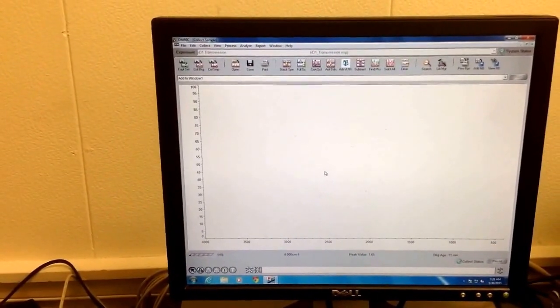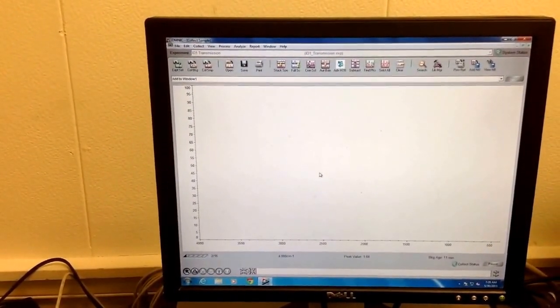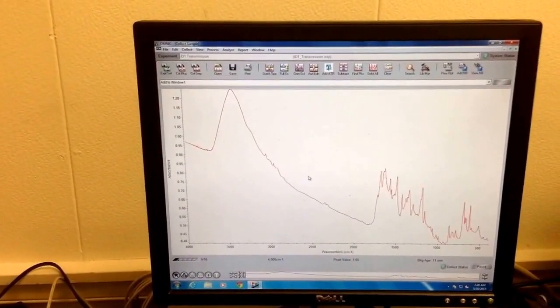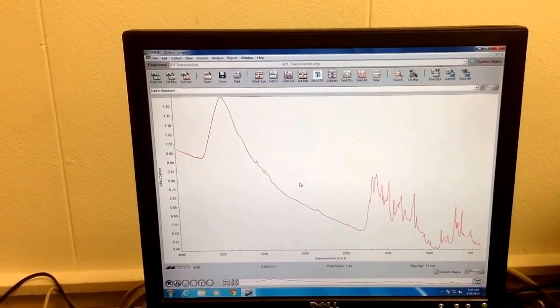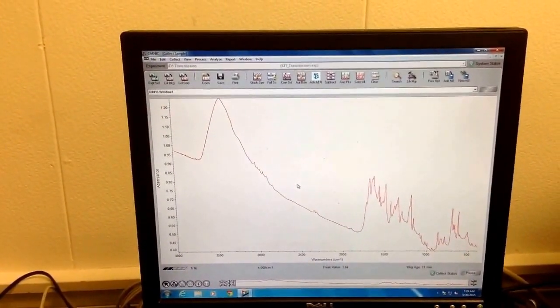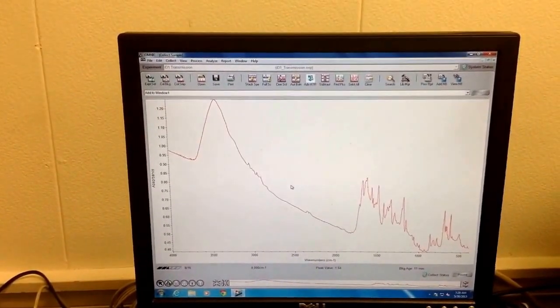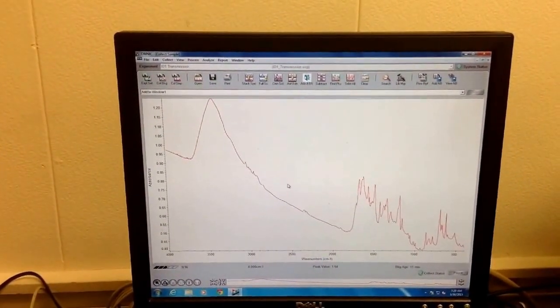And we can see after a few scans, it'll start showing the spectrum, and there's a lot more to look at here. Once this gets done with the absorbance, we'll look at it a little more carefully.